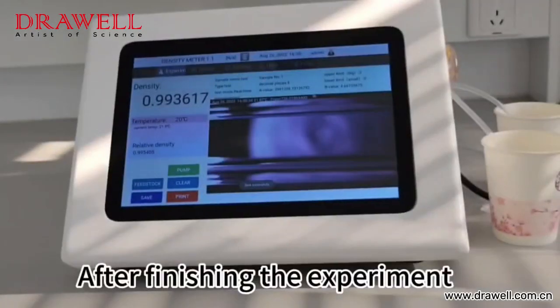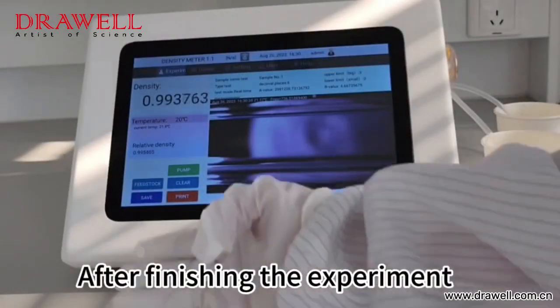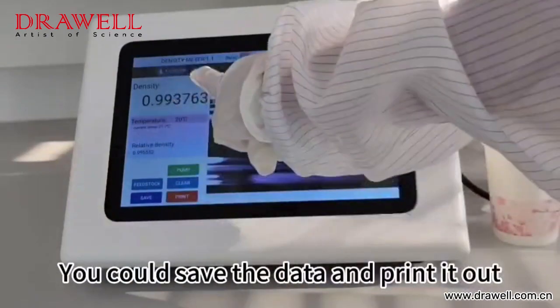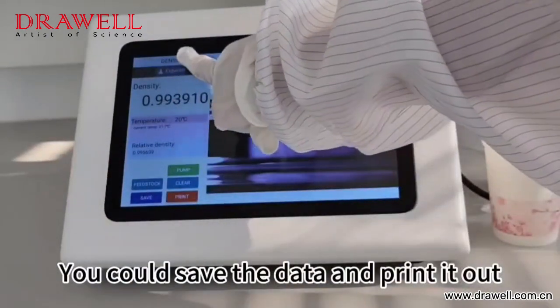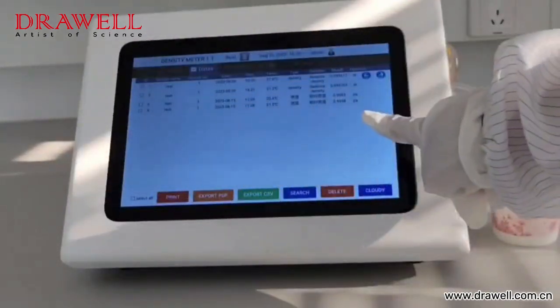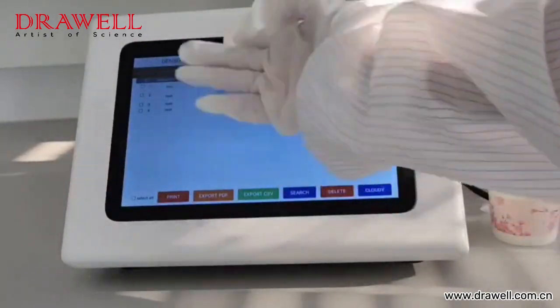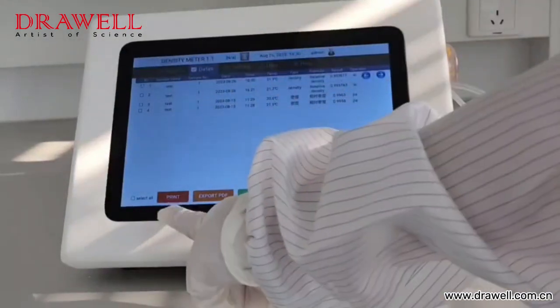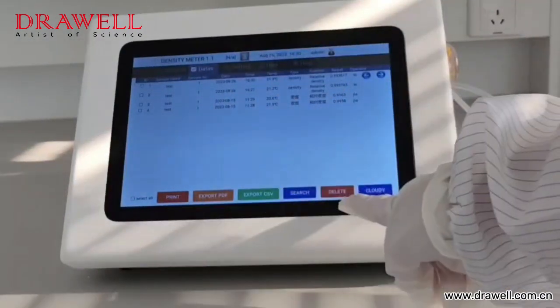After finishing the experiment, you can save the data and print it out. Check the data.